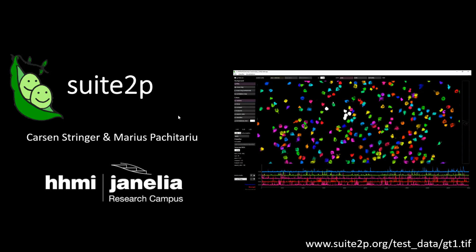So if you want to follow along with me, you can download the tiff here at www.suite2p.org/testdata/gt1tiff. So this is a tiff I'm going to run during the demo. Okay, so let's get started.